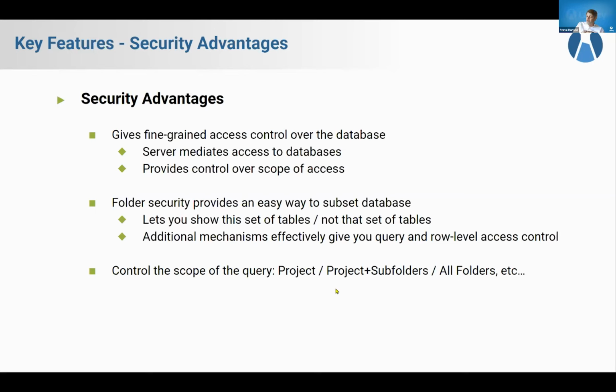So what you can do is use LabKey SQL to build a query inside of folder A that isolates out the data that you want to show, the safe data for that one audience. Now that's not quite enough, because if you let people into folder A, they're going to see that query along with the big ball of data that it came from. But you can add an additional mechanism called the linked schema and move that query. You can project the query you built in folder A and show it in folder B.